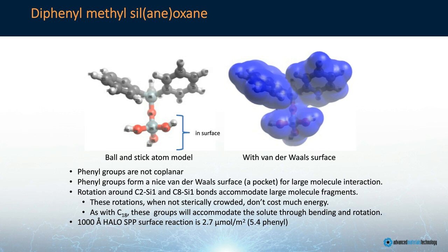These phenyl groups are not coplanar, which is why sometimes this phase can be confused with other bonded phases, but in this particular computational analysis, the phenyl groups form a favorable van der Waals surface, or a pocket, for these biomolecules to interact with. And the rotation around the C2 Si1 and the C8 Si1 bonds will accommodate the larger molecule fragments.